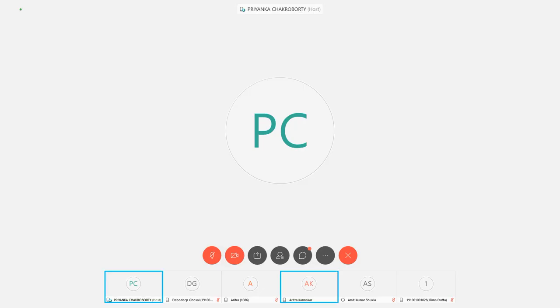Next, ketone or aldehyde. Ketone-aldehyde differentiation test, Tollens reagent test, silver mirror test. In the assignment, write down the balanced reaction of the 2,4-DNP test. Is it a condensation reaction or an addition reaction? What kind of reaction is this? So it is a condensation reaction.